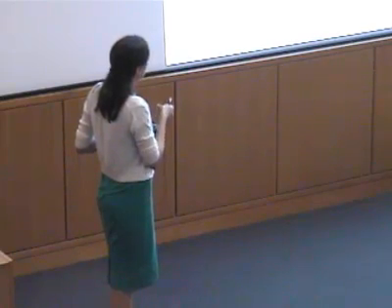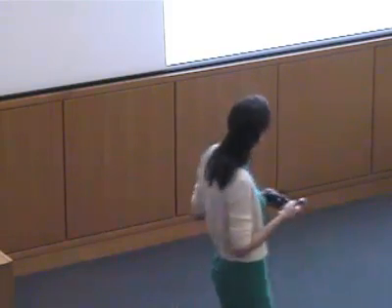And you can also very nicely see this in the Fourier transform as the signal just dies out as we go further. Okay? The other thing that's perhaps very straightforward to think about is to look at how coordination number actually affects your EXAFS. So this is now completely linear. This is just looking at 1 copper-nitrogen interaction at 2 angstroms versus 2 versus 3. You can see the linear increase in the amplitude of your EXAFS signal, and similarly a linear increase in the amplitude of your Fourier transform. And so these are relatively easy things to at least start to get some comparative intuition about when you look at different data sets. Okay.